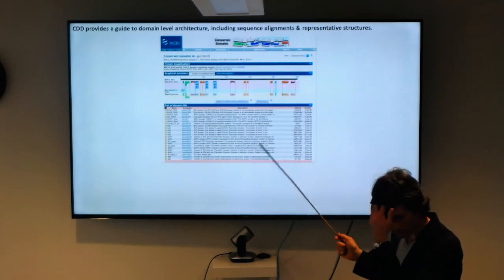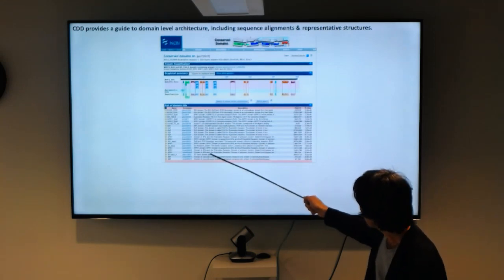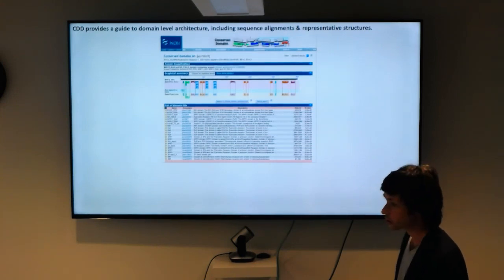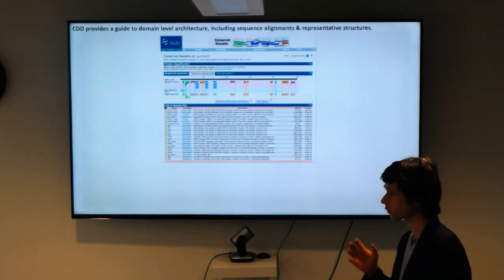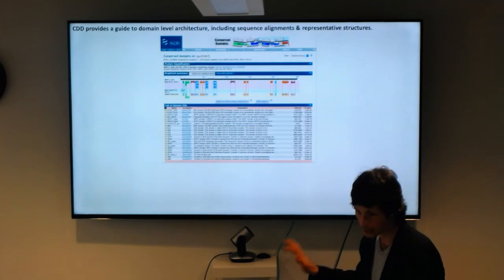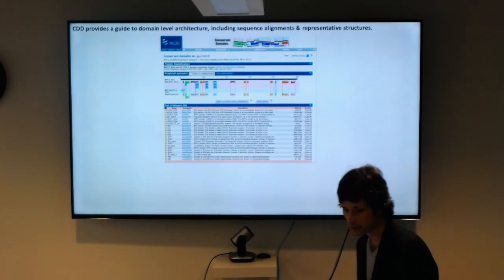So this is for the ryanodine receptor, which is a very large multi-domain protein. And you can see that you can identify a ton of different conserved domains, just from the get-go, which are then really useful if you have a map that you want to start modeling, because they provide anchor points that you can use both to model those parts, but also to give you sequence anchors for the regions that you don't know, for which there are no sequence-identifiable structural templates in those adjacent regions.